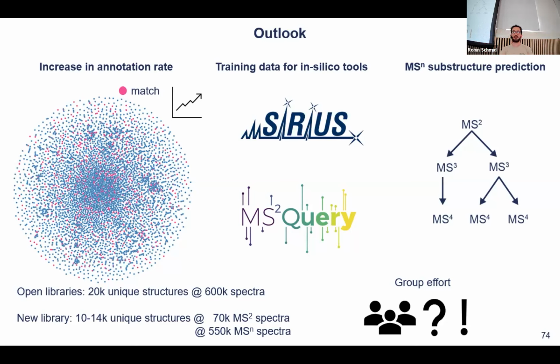But for us, it was really like, why not directly do DDA? And if we miss out on something, we can still go back and do multiple injections more, but we already have information. We might even see that some of the fragmentation energies were still too low, even though we used 3 different energies. Then we can go back and say, okay, we want more out of this, and we can go back and inject more.